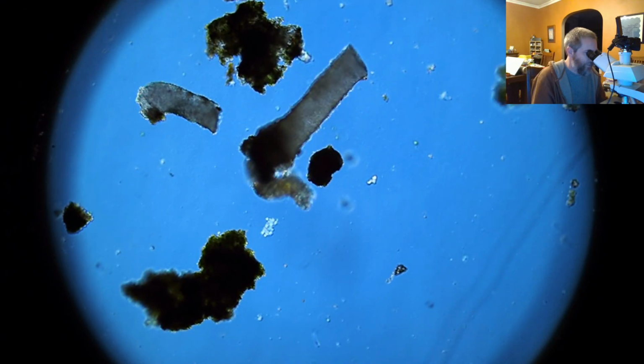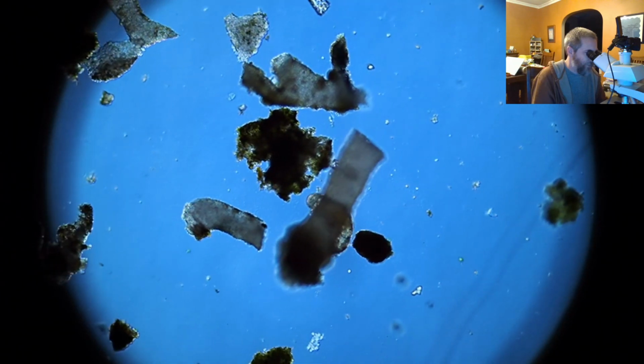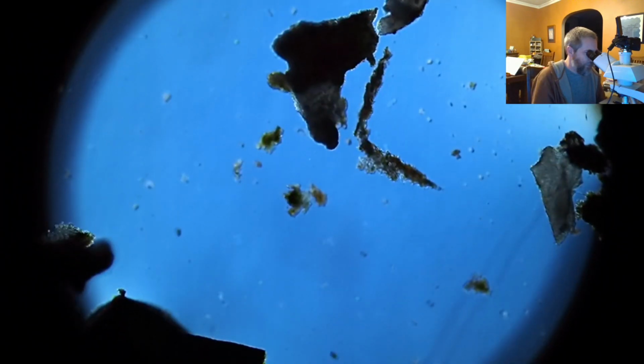I don't think they were dead. I don't think staying alive that long caused them to perish or anything, because there still seemed like there was plenty of food, this green stuff all around. This little bit of lichen was everywhere. So I'm pretty sure that's what they eat most of the time. And yeah, I don't know. Not sure exactly how long to keep them that way, and if you dry them out, how long before you should re-wet them. But I suspect there's just food everywhere in here. They wouldn't be living there if it wasn't a good environment for them.